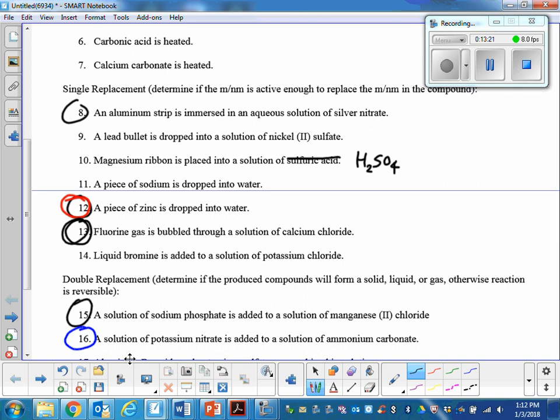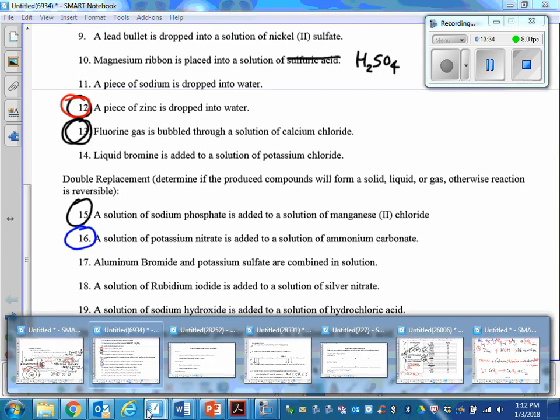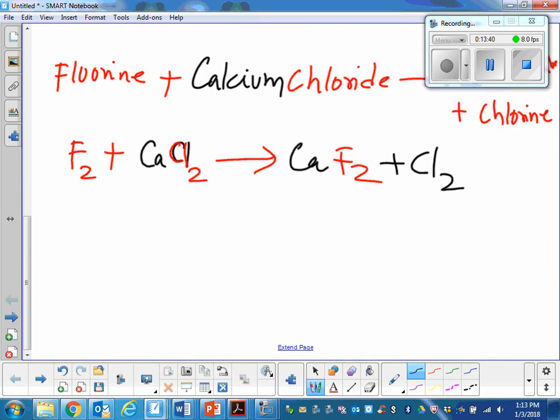Okay? Now, let's go to double replacement reaction now. Okay? We are going to see the product of a double replacement reaction. Now, we're going to do the very first example. All right? With sodium phosphate and manganese 2 chloride. So this is a double replacement.